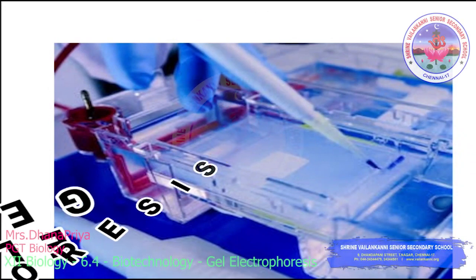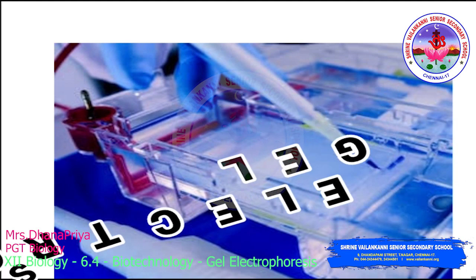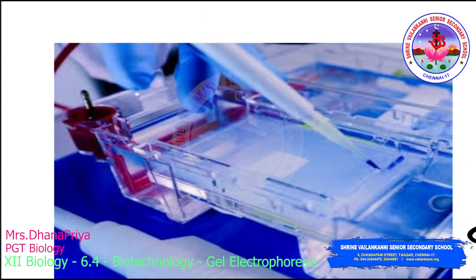Hello students, in the previous class we studied the tools of recombinant DNA technology. So today we are going to discuss a new topic, gel electrophoresis.